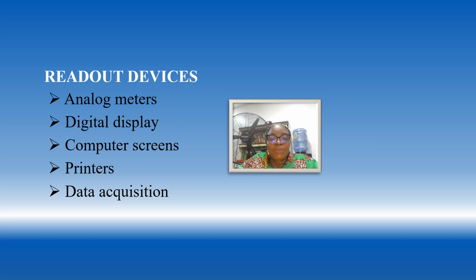We'll have the experimental condition, the observed data, the statistical values and calibration curves can be obtained through modern equipment. And the readout device is an essential component of AAS as it enables the user to interpret the result and make informed decisions based on the analysis.